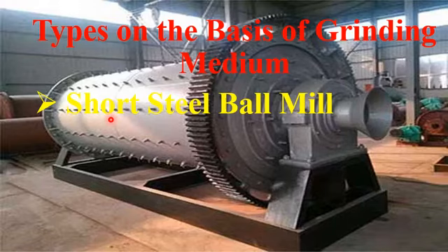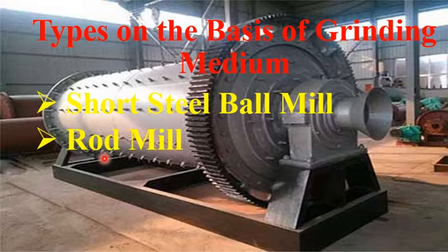Another type of ball milling machine based on a grinding medium is the rod mill ball milling machine. Basically, a rod mill ball milling machine is usually equipped with steel rods with diameter mostly between 50 to 100 millimeters.